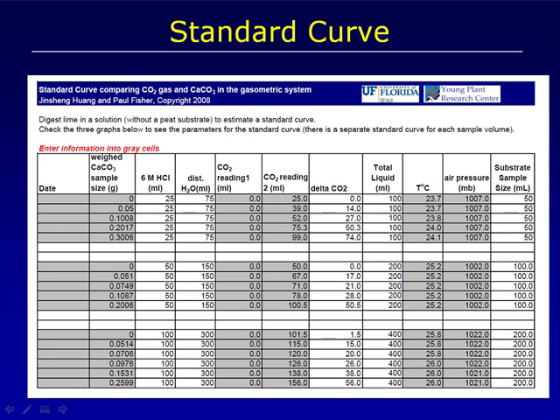Once the apparatus is working normally, then you can develop standard curves with different sizes of substrate sample. Now normally you'll use a 50 milliliter sample of substrate, which are the top group of cells. Usually that 50 milliliters is about the right sample size. However, if there's only a very small amount of carbonate in your sample, we would recommend that you run a second set of samples with 100 milliliters. In our experience with our setup of the lab equipment, 200 milliliters is not very practical, but it can be run through the system.